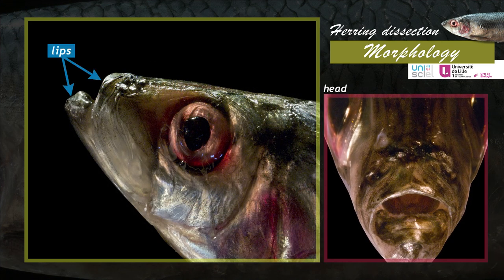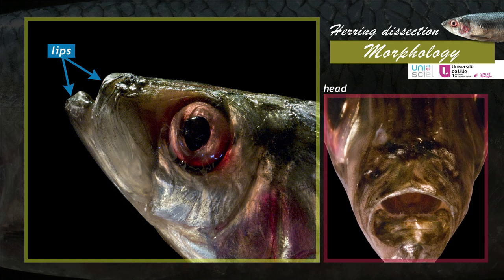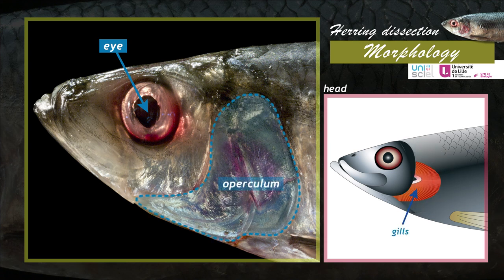The mouth is defined by two lips held by the jaws. Located above the mouth, the nostrils only play an olfactory function for the fish. The eyes have no eyelids. Behind the eye, in a lateral position, are visible the opercula — ossified flaps covering and protecting the gills.